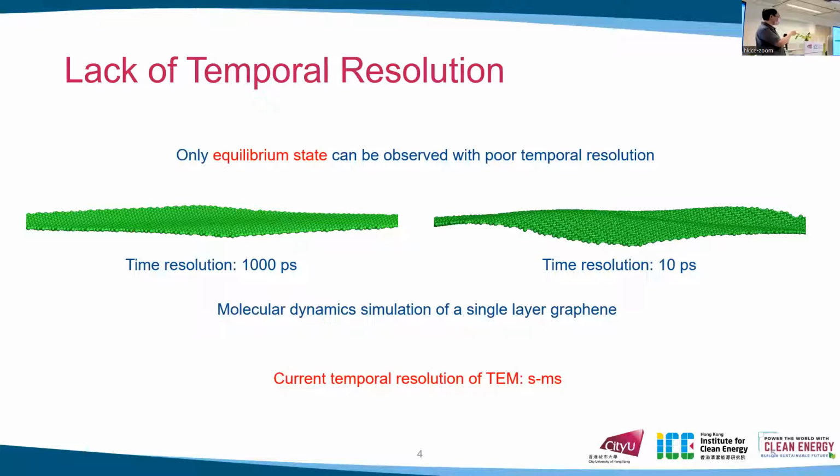Currently, the temporal resolution of TEM is around seconds to milliseconds. Compared with the spatial resolution, the temporal resolution is still poor.